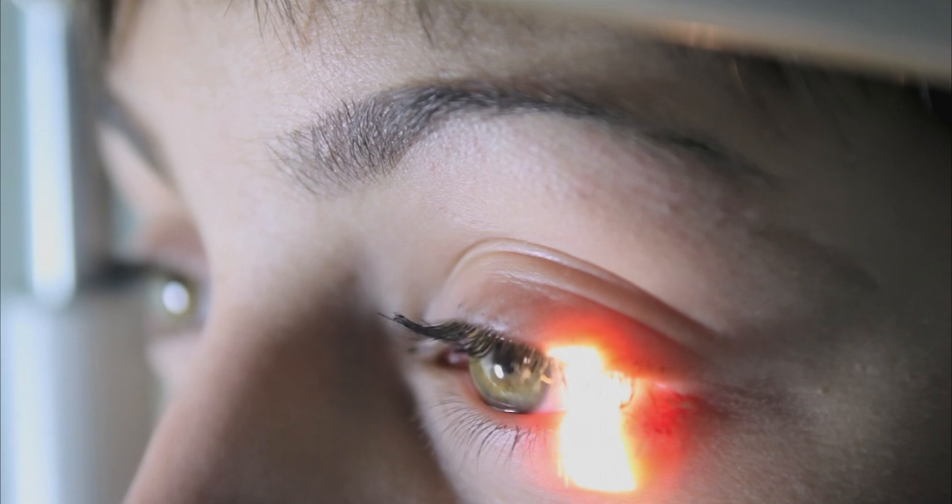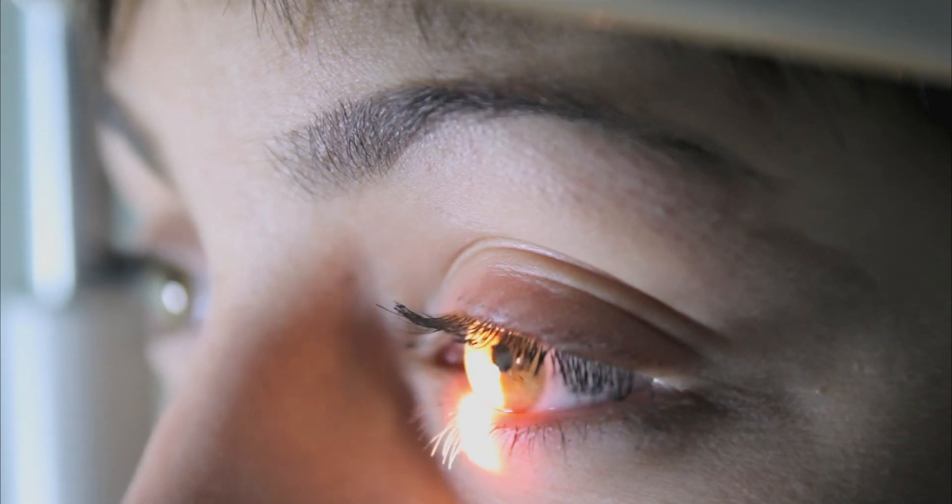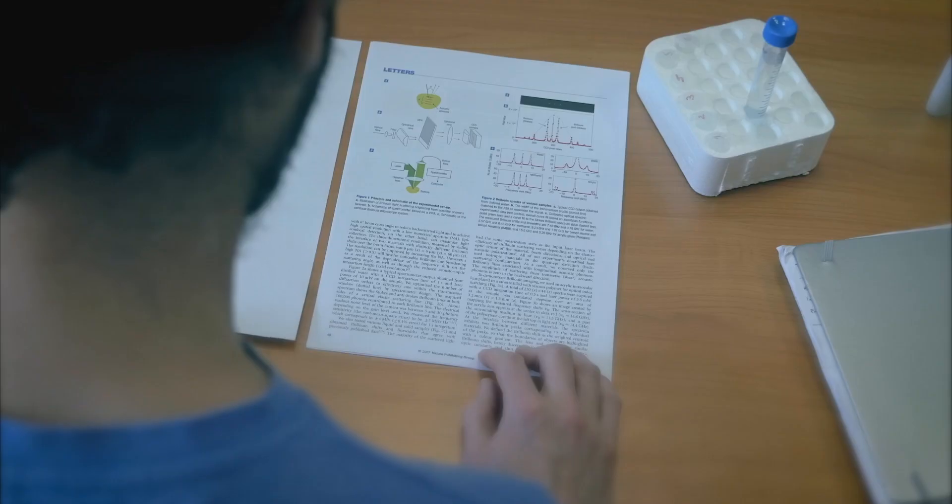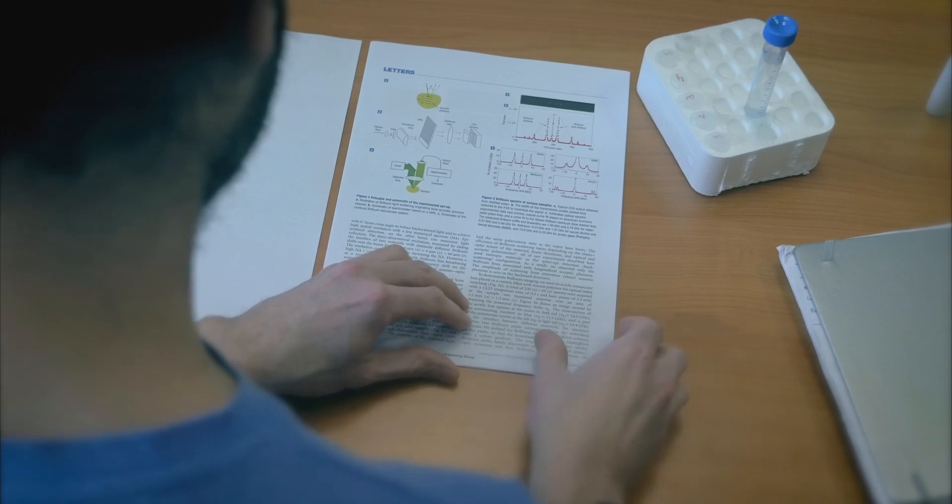Brillouin microscopy has, thanks to technological innovations, only become suitable for measuring live samples of biomedical interest over the last decade.